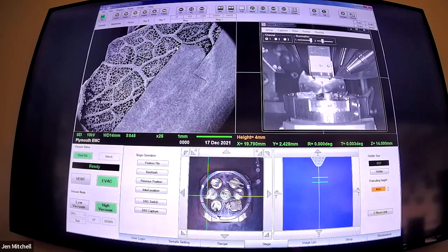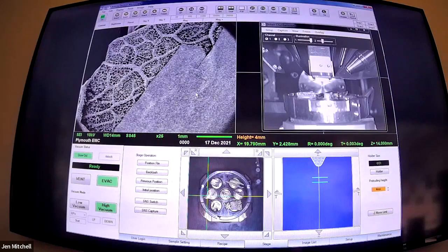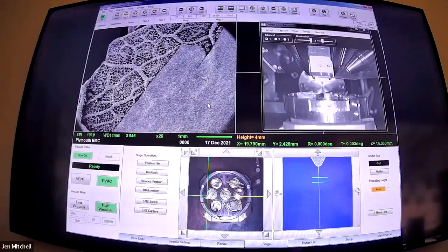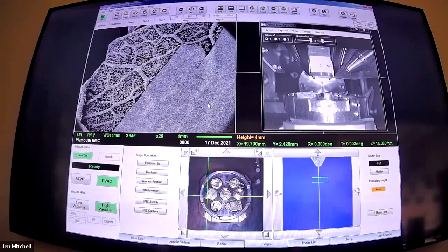It also means we get to have some fun with liquid nitrogen, because that just looks very ominous. It's a great day when we get the liquid nitrogen. So we've done sample six, we're saving seven till the end, we've got numbers one through five - we'll see where we go next.